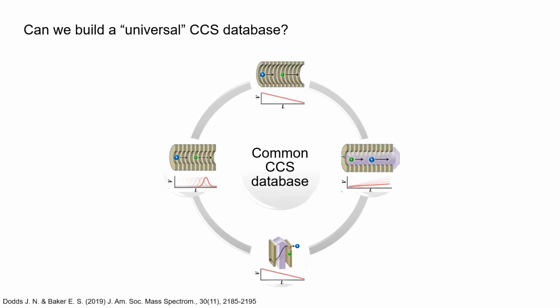Over the years, scientists and researchers have desperately attempted to find out if the CCS of an analyte obtained from a specific type of instrument is equivalent to the CCS obtained from another type of instrument from a different ion mobility technology. For example, comparing the CCS derived from traveling wave with the CCS derived from drift tube, trapped ion mobility, or differential mobility analyzer.